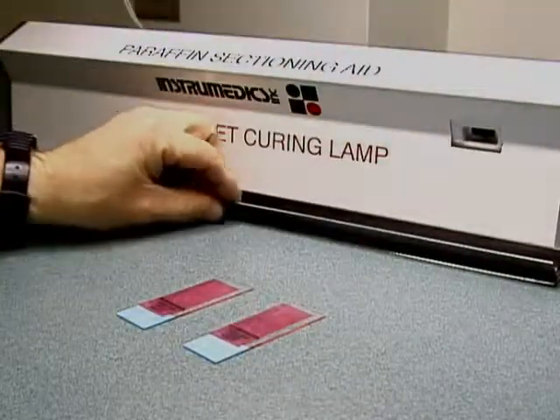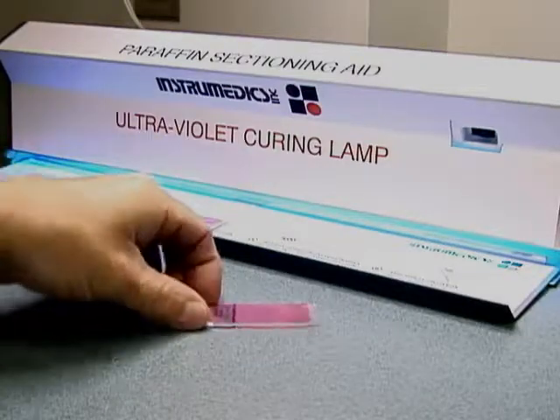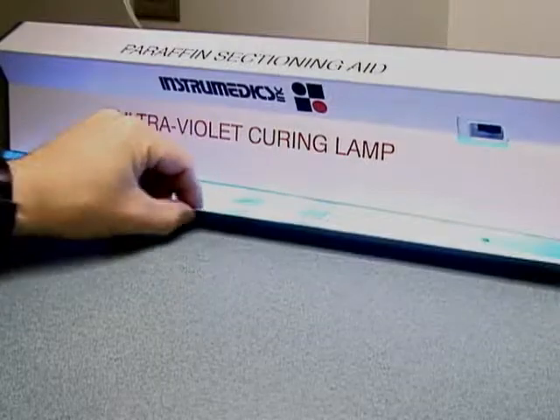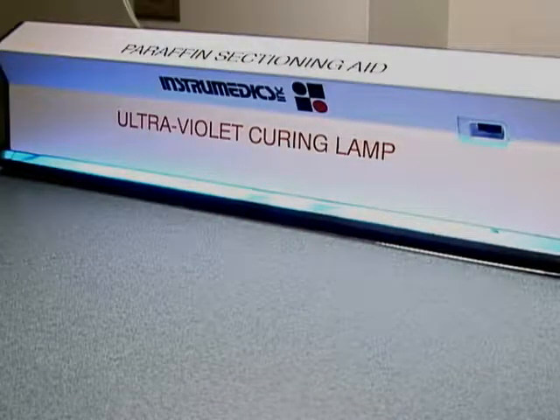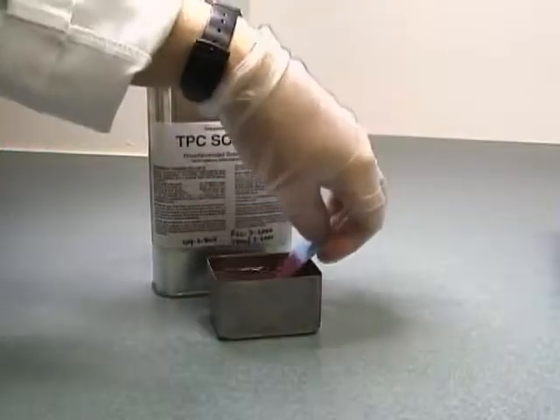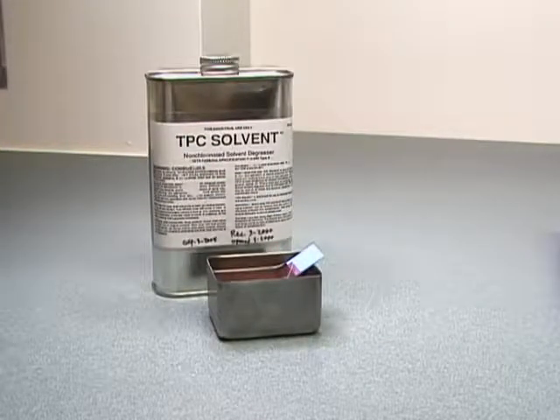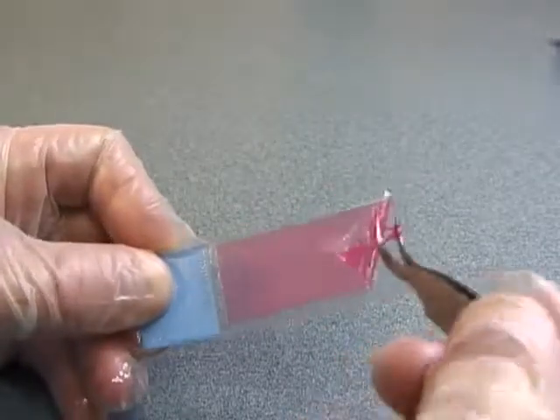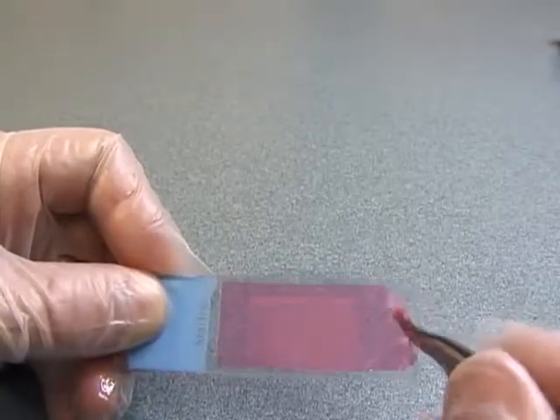Set the slides in the ultraviolet lamp for approximately 30 seconds to 1 minute. This cures the adhesive, sticking the sections to the slide. Before removing the tape, place the slides in the TPC solvent for 30 seconds. This oily chemical does help lift the tape off the slide easier. Use protective gloves for this procedure.